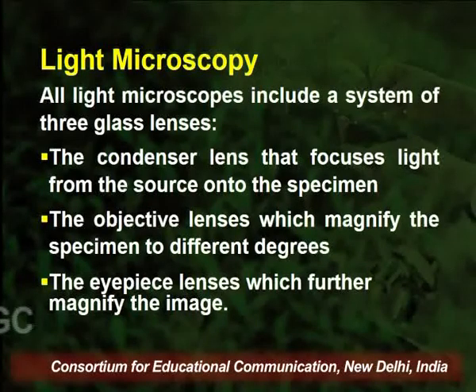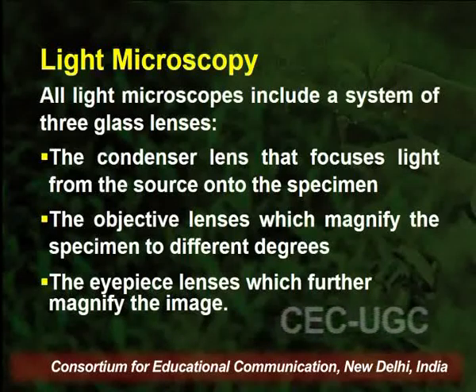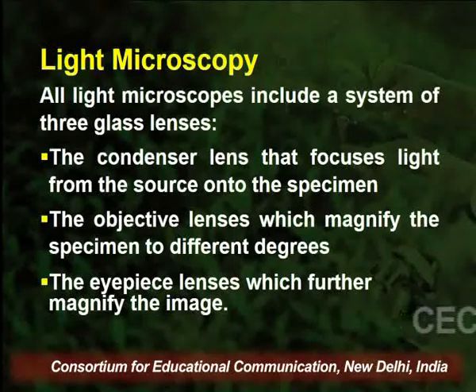So there are different types of light microscopes, but all light microscopes include a system of 3 glass lenses.